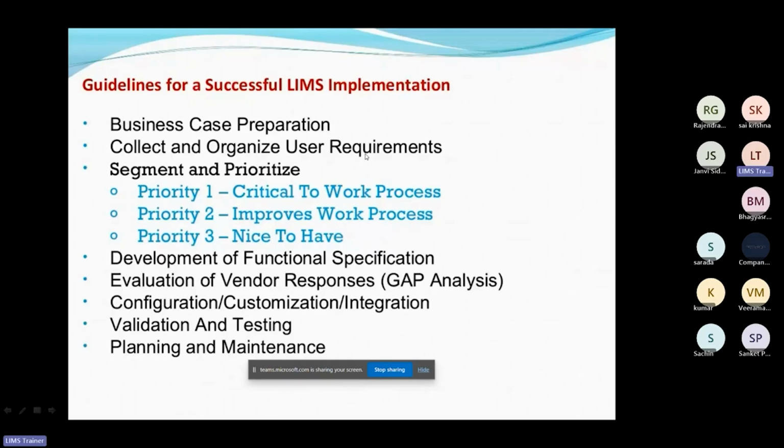After this, he needs to enter the data into the software. For example, he wants to enter the weights, whatever he has taken, inside the software. So here another user requirement is created. I will explain these details in our full course; here I'm explaining with one or two examples.